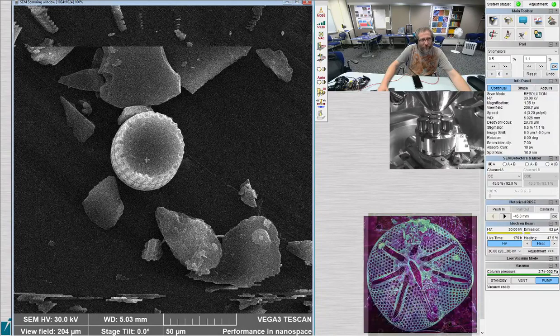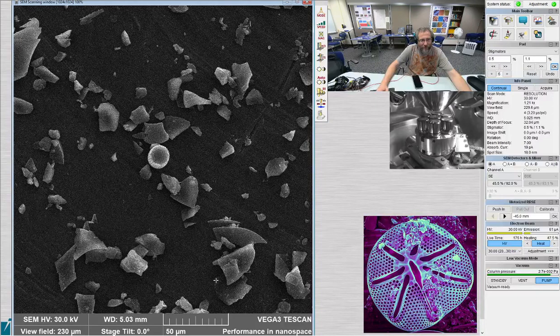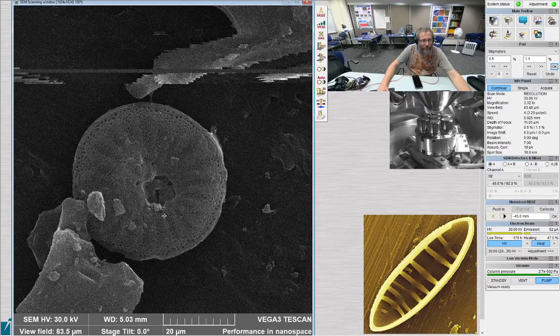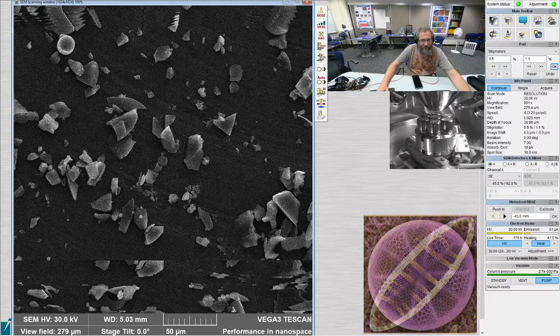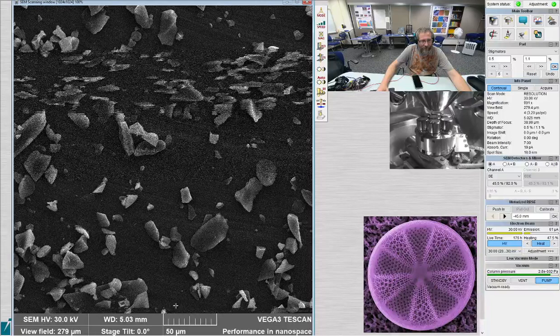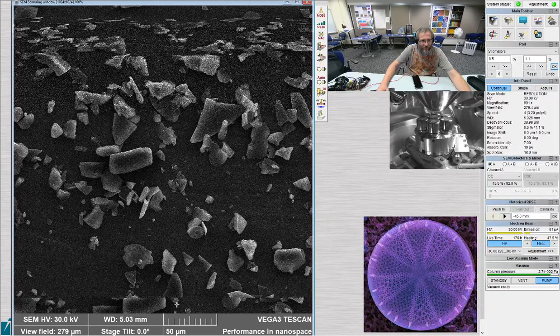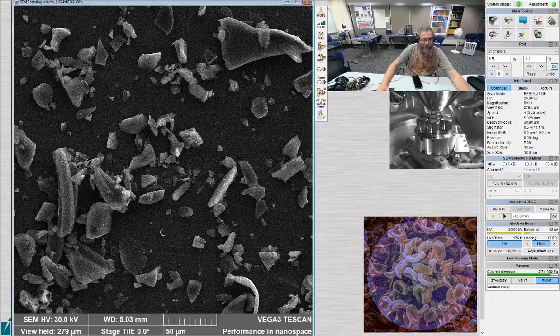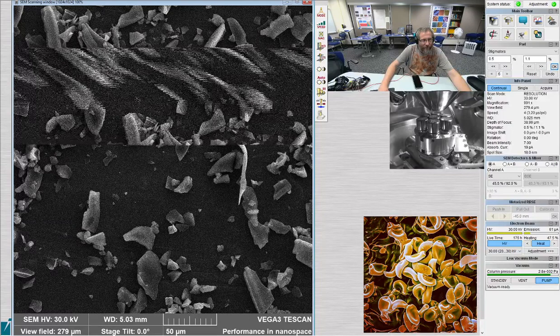Boring. Velocicera. Top view. Little tiny guy we've seen a bunch of. Like a crater in the outside of it. I do feel like we're starting to get a handle on at least a number of species that we're looking at. Yeah. Well, that's just it. The longer you look at stuff in the SEM, it's like, nope, that's that one. That's definitely this one. It becomes less of a chore to identify.